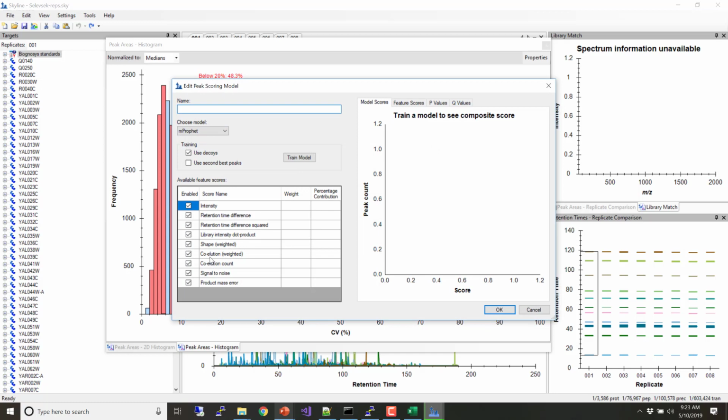So we're not doing this on the osmotic shock data. We're not trying to get rid of transitions now. We do the cleanup on a first data set, and then we redo the experiment, which is statistically way better than trying to clean up data that you're trying to run your statistics on. So you really would like to lock down your experiment, run the experiment through, and then do the statistics.